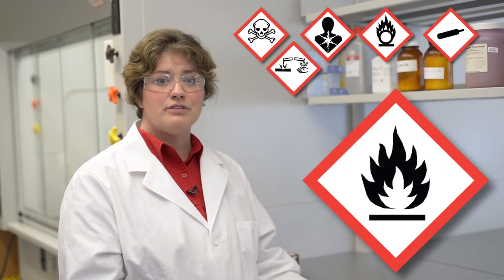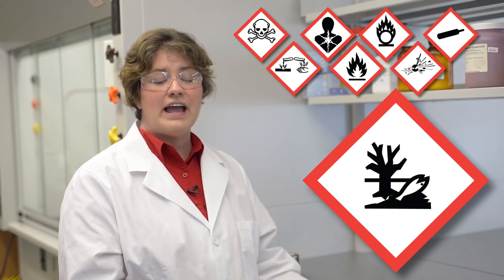Other common hazards include flammables, explosives, environmental hazards, and general health warnings.